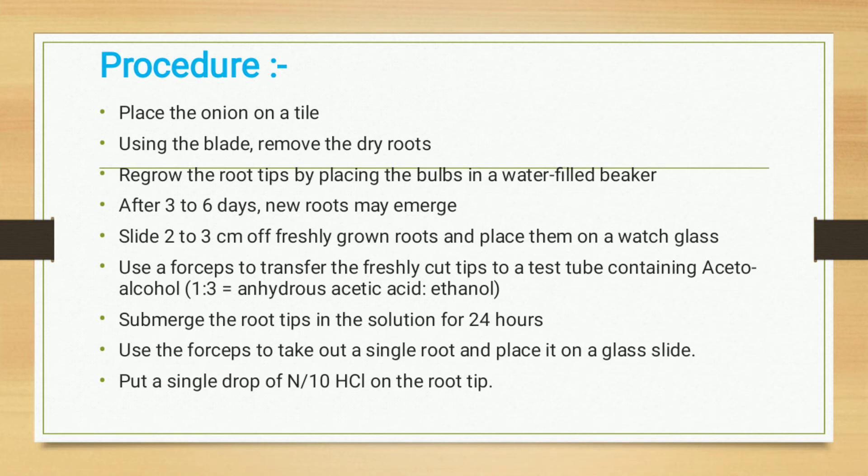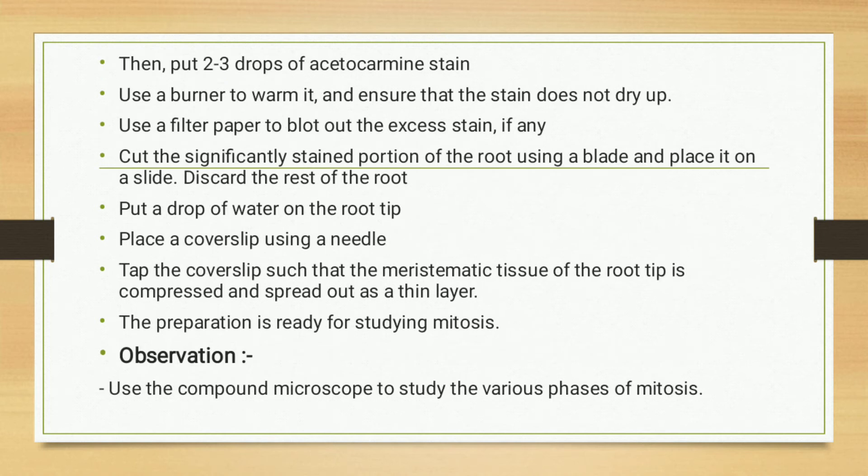Use forceps to take out a single root and place it on a glass slide. Then put a single drop of HCl on the root tip, followed by two to three drops of acetocarmine stain. Use a burner to warm it and ensure that the stain does not dry up.